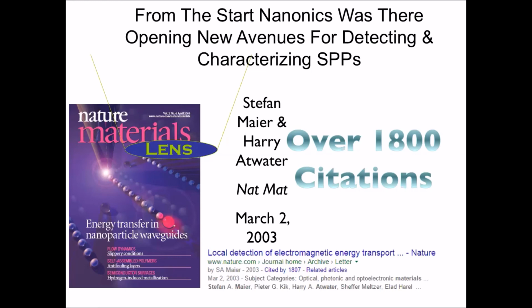So you shine light at one point in the near field, you need a near field probe, and then the plasmons actually interact between the particles. Eventually they reach this fluorescent particle, they're converted back into fluorescence, and they're collected here. When I made this slide, it had 1,800 citations. Today I went by chance just 2 days ago to see this paper. Yesterday is 2,500. Okay, it jumps by about 1,000 every 2 or 3 years.